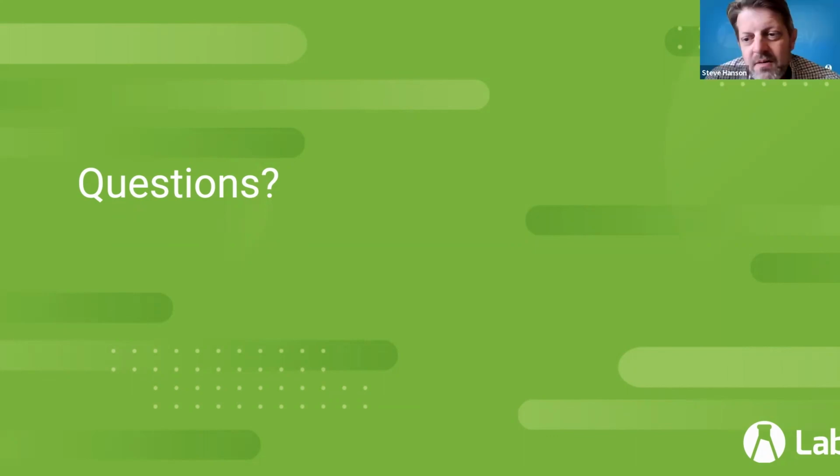Any other questions out there? Well, also, I know some of the developers here are working with Jupyter right now. Care to give us a little preview of what you have coming out? Yeah, Matt, you want to? Oh, yeah, handing the potato.